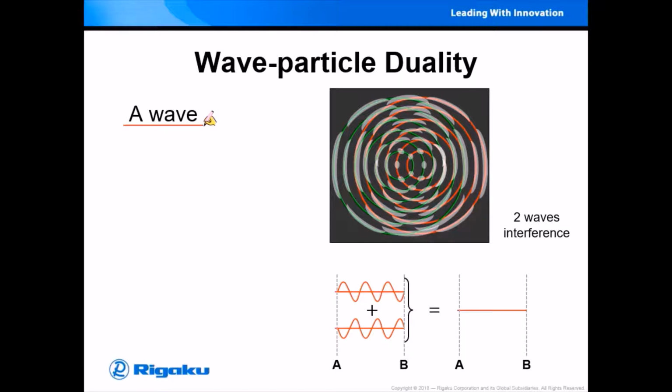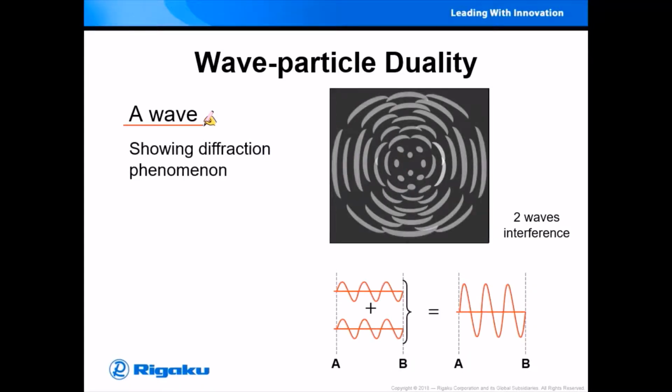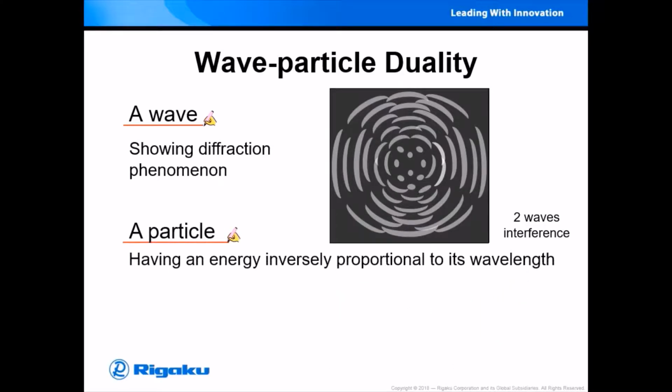The same wave interference occurs with X-rays too. When X-ray wavelengths are in phase like the wave interference of water, the diffraction phenomenon is exhibited. And X-rays also behave as particles. Therefore they can be counted 1, 2, 3 and so on.